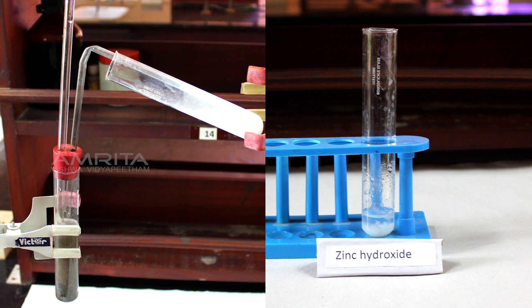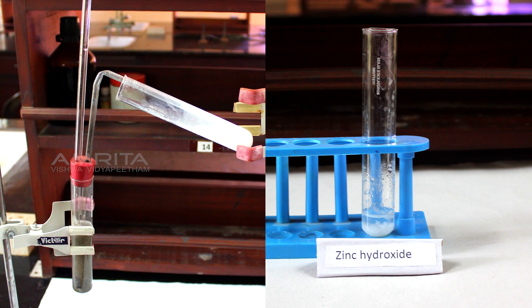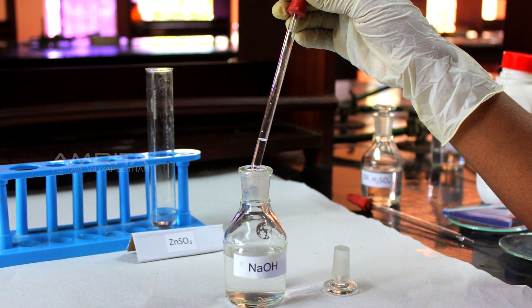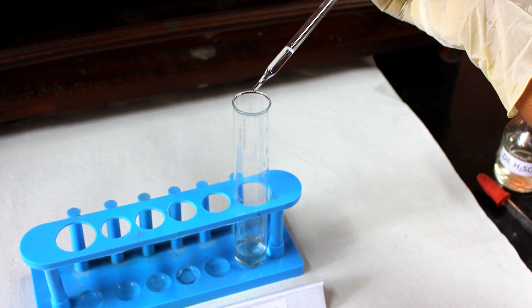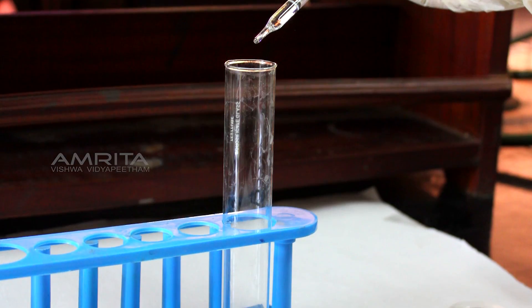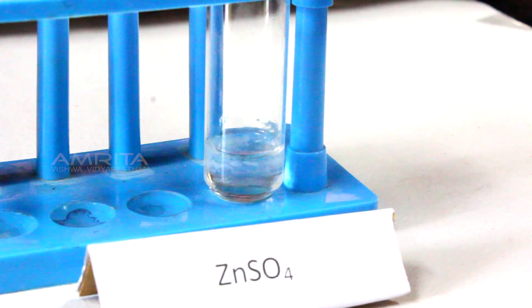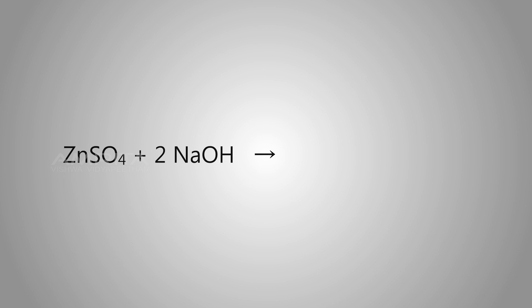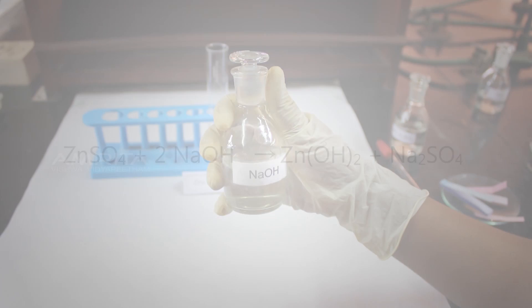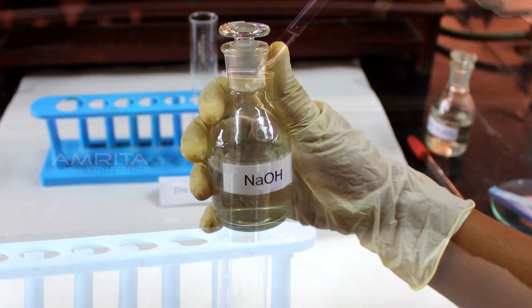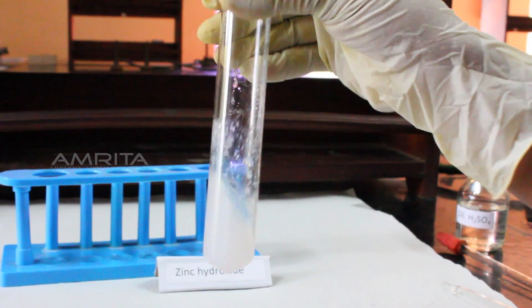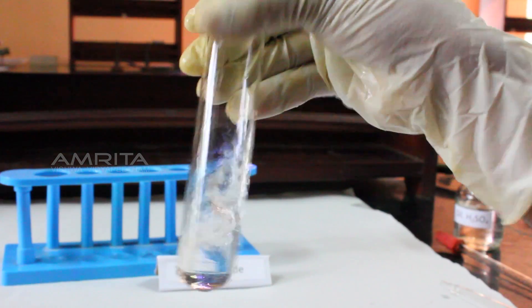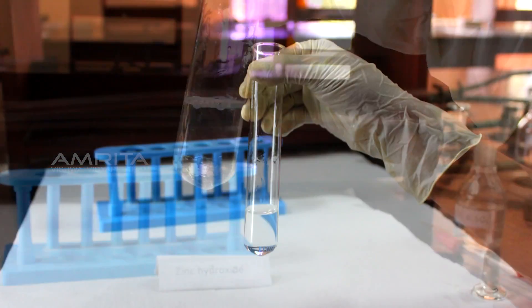We can do two tests to confirm the presence of zinc sulphate solution in this reaction. In the first test, add a few drops of NaOH solution into the boiling tube containing zinc sulphate using a dropper. On adding the NaOH, a white gelatinous precipitate of zinc hydroxide is formed. ZnSO4 + 2NaOH → Zn(OH)2 + Na2SO4. Again, add excess NaOH into this white precipitate and shake the boiling tube well. We can see that the precipitate dissolves on adding excess NaOH.